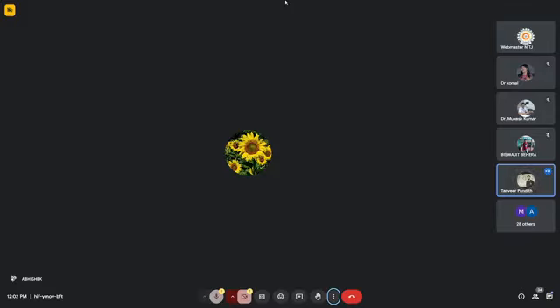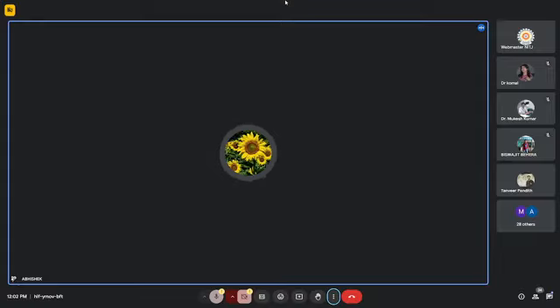Sir, these three modes are independent of the collection of samples. In some areas, whenever we collect samples, there is a very high concentration of uranium, and in some areas there is a very low concentration in groundwater samples.